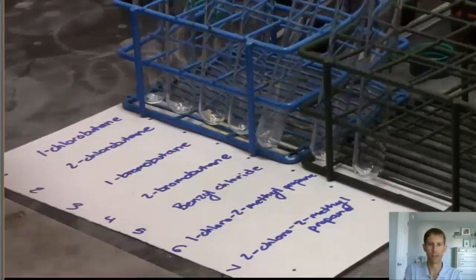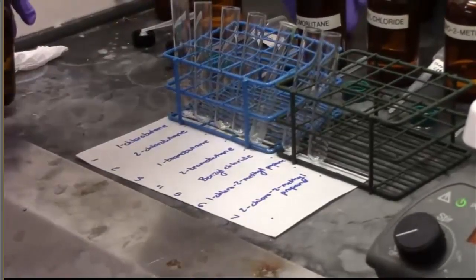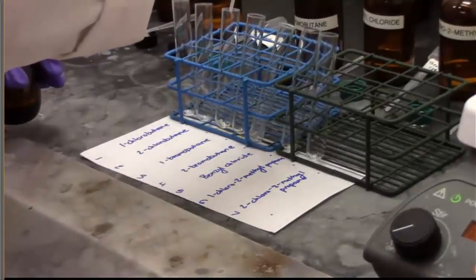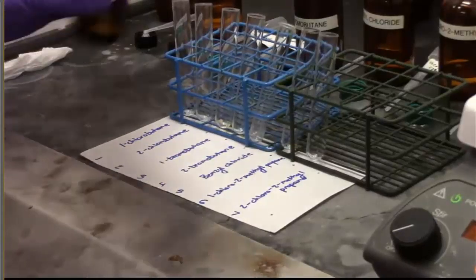So here we have the test tubes already set up. We've got all of the test tubes labeled for what compound is going to go in each of them. We're going to add those compounds to the test tube with a dropper, adding 5 drops to each, and then we are going to add the solvent nucleophile combination shortly after that. So you can see each of those compounds in the background. Those are all liquid at room temperature, and we're adding 5 drops of each of those compounds to each test tube.